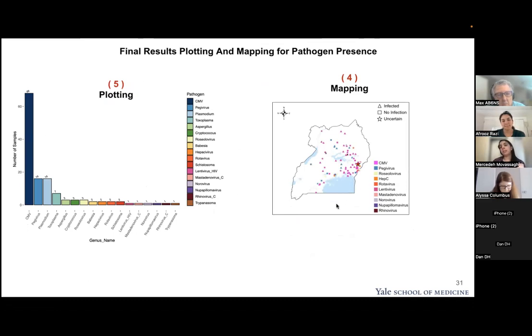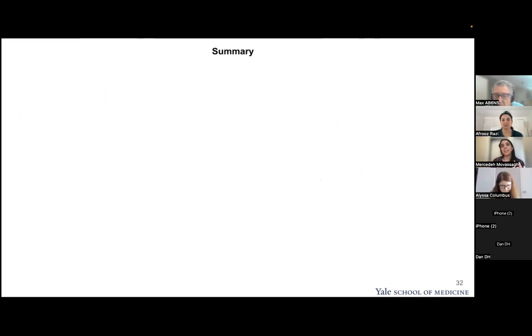We did a little bit of spatial statistics as well, and we're doing some mappings. If you have spatial information, like the village or the city your samples are coming from across the country, we could do mapping for you in like a one-liner and tell you what pathogens are coming from which regions. And so basically this is what PathSeeker does.